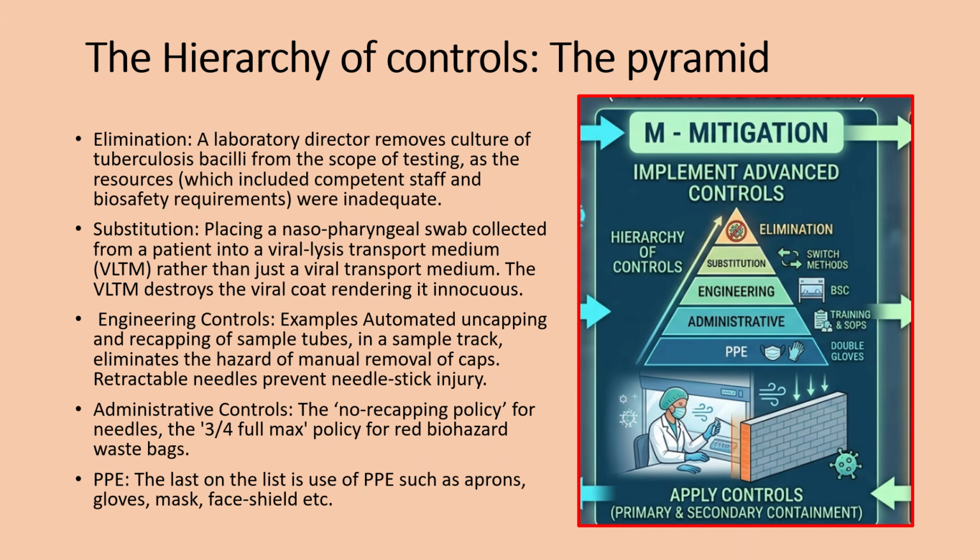Administrative controls. The no recapping policy for needles, the 3/4 full max policy for red biohazard waste bags are examples of administrative controls. The last on the list is the use of PPE such as aprons, gloves, mask, face shield, etc.